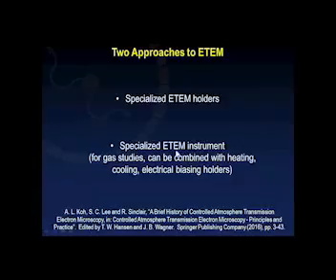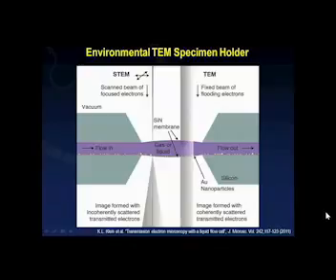And I should add that the ETEM instrument is specific just for gas cell studies. The nice thing about having an instrument is that you can combine it with other specialized holders, be it heating, cooling, or electrical biasing. So let's move on to this slide, which shows the schematic of what a specialized environmental TEM holder looks like.